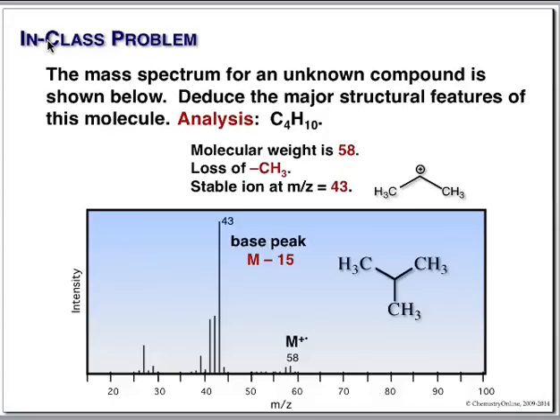Now if you're really picky, look at this. Here's a molecular ion of 58. We have something else here, maybe 59-ish, don't we? Why in the world do we have that? Because carbon has isotopes, doesn't it? So some of this stuff has a little bit of carbon-13 in it, so its actual weight would be 59. So you'll always see isotopes slightly above the molecular ion.